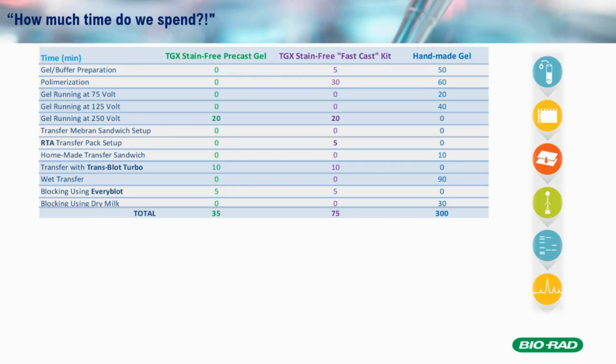Instead, a qPCR experiment can be completed in 2-3 hours, or a multiplex ELISA, even with hands-on time, can be completed in 3-4 hours. The traditional Western blot may take quite a bit longer than the other molecular biology tools.